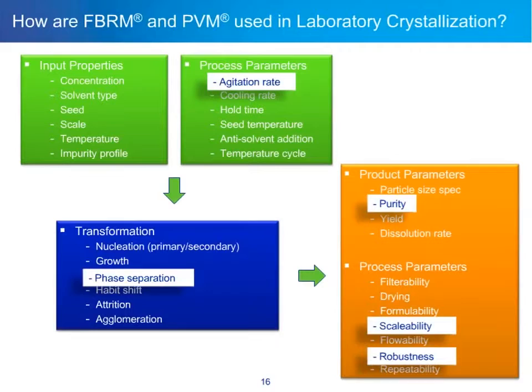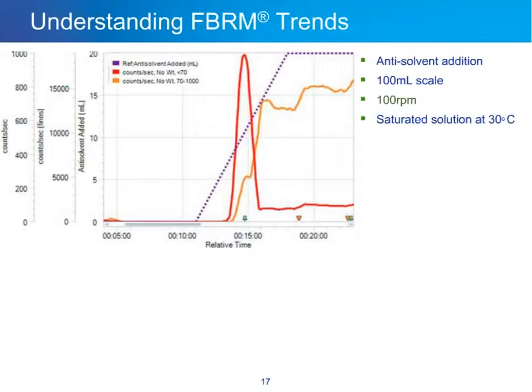Our next example is identifying crystallization problems at the small scale. We're looking at agitation rate as a key process parameter and its impact on phase separation, and how this impacts purity, scalability, and robustness. This is an anti-solvent addition crystallization at 100 mL scale. For the first experiment, agitation is at 100 RPM with a saturated solution at 30°C and constant temperature for the duration of the batch.